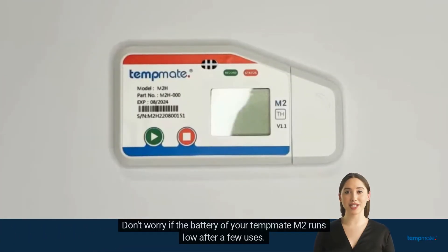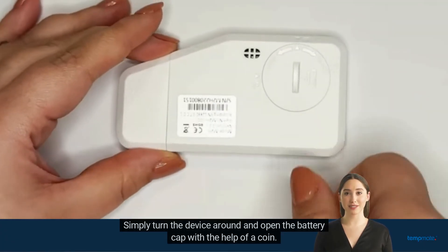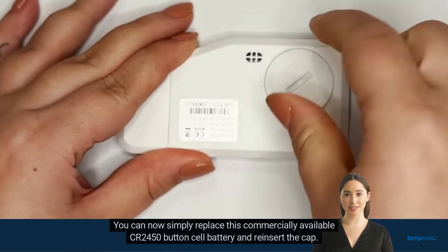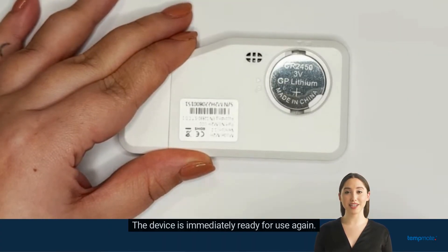Don't worry if the battery of your Tempmit M2 runs low after a few uses. Simply turn the device around and open the battery cap with the help of a coin. You can now simply replace this commercially available CR2450 button cell battery and reinsert the cap. The device is immediately ready for use again.